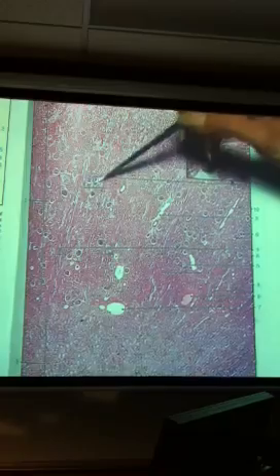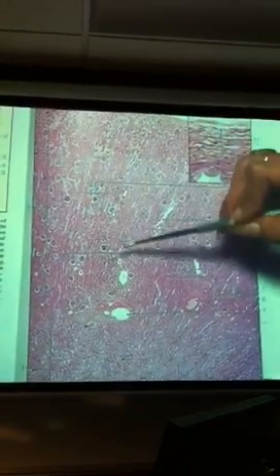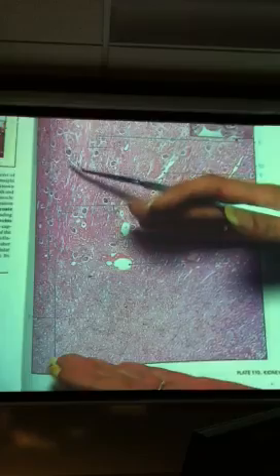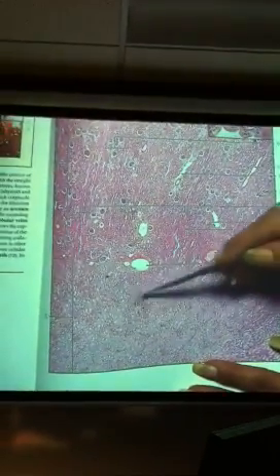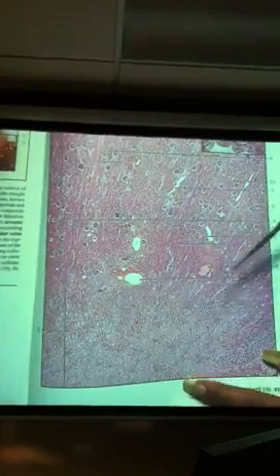So whenever you see the renal corpuscles, you know that you are in the renal cortex. The renal medulla, on the other hand, is the same texture, but minus all of the renal corpuscles.